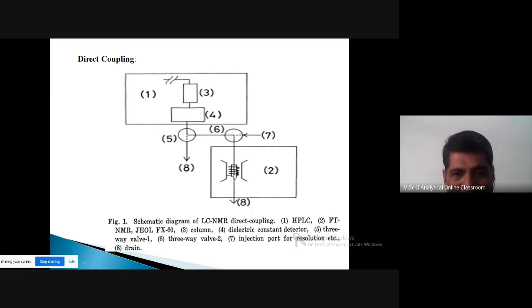पण दिस टेक्निक हॅज सम लिटल प्रॉब्लेम वेन सेपरेशन ऑफ द कॉम्पोनंट इज व्हेरी डिफिकल्ट. तर त्यांच्यामधलं सेपरेशन खूप कमी असेल, म्हणजे एका मागे एक येत असतील, तर त्यावेळेस थोडंसं आपल्याला जास्त काळजी घ्यावी लागते. त्याला थोडंसं मॉडिफिकेशन करून त्यांच्यामधलं सेपरेशनचा टाइम आपल्याला वाढवावा लागतो. ठीक आहे, सो त्या ठिकाणी अनालिटिकल केमिस्ट्रीचं काम येतं, कारण दिस इज द सगळं ऑटोमेटेड आहे. तुम्ही सॅम्पल इंजेक्ट केले की ते होणार आहे.